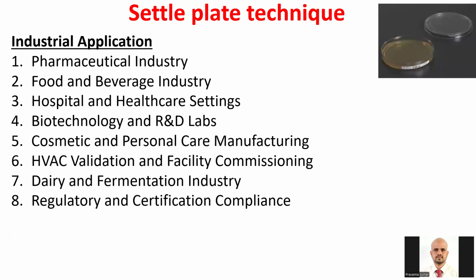In the cosmetic industry, even in the packaging area, microbial spoilage should be studied, for which the settle plate is important. Even for ISO certification, ISO 22716, the cosmetic industry will demand this monitoring. Heating and ventilation systems in other processing units need this as a control check. It is a performance check of HVAC systems, and even whether the HEPA filter in the room is working fine or not needs to be validated by the settle plate technique.